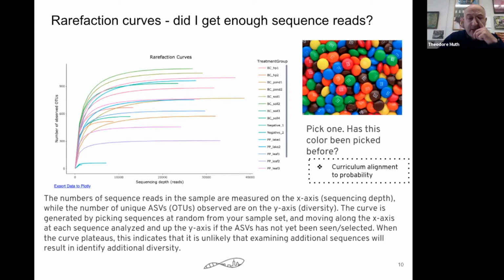And I think I mentioned last week that this demo data set that we've shared with you are the soil samples that we sent to Wright Labs in Pennsylvania to do the sequencing. You can see here that they're typically getting us between 20 and 30 to 40,000 reads per sample, which in this case is enough to get most of the diversity there.